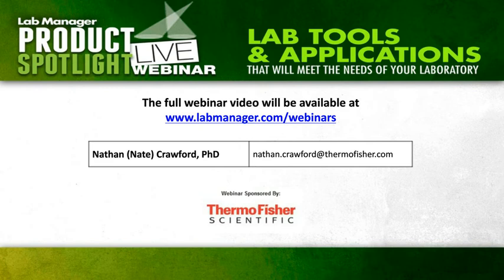Also, within the software, like we saw today, you can actually load images and videos into your measuring procedure. So you can use images of how to properly load a sample or transfer it from a storage device, or how to properly trim the sample, or actually how to properly clean up the geometry after a test.